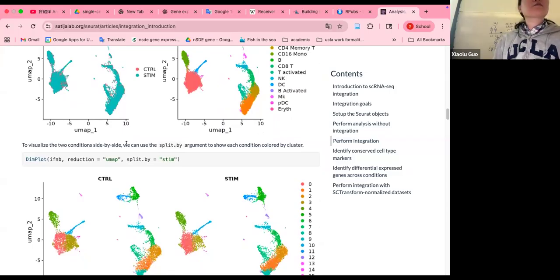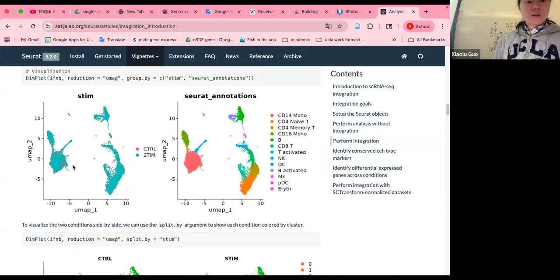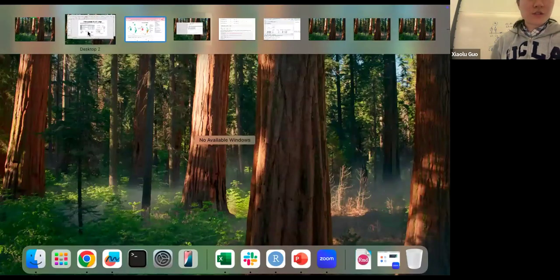And using what we just did, you can identify the gene markers, or identify what is differentially expressed in the macrophage in this condition versus the macrophage in this condition. And you can do that, the differentially expressed genes.